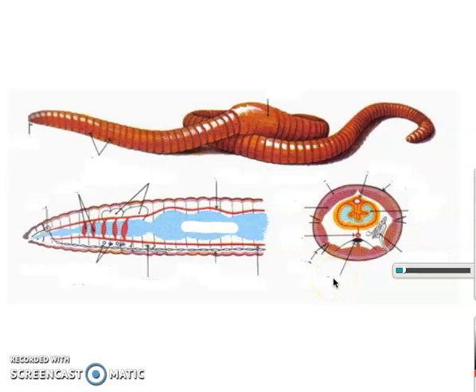All right, we're going to go over the basic parts of an earthworm. And earthworms are in the phylum Annelida, or Annelids. Okay, so let's start with the exterior here.